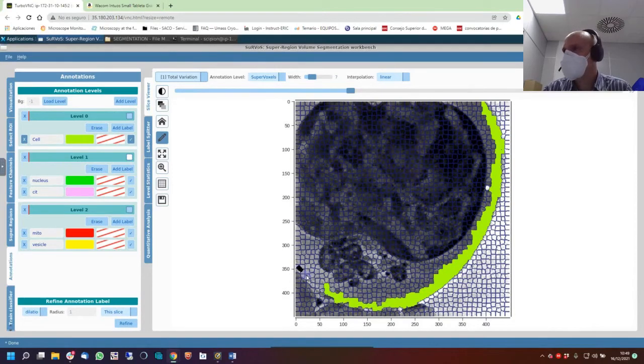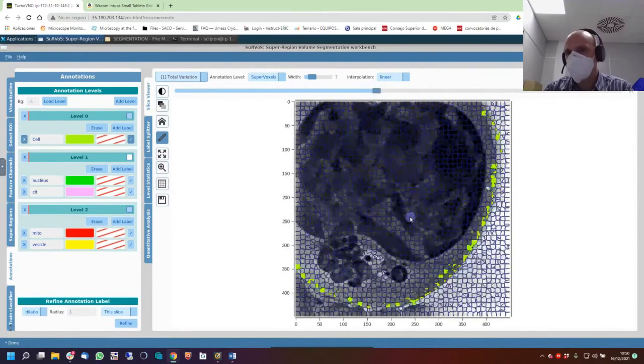You got it? You can play with this a little bit. You see what's different, no? On your own. And then with the wheel of the mouse, go up and forth. You'll see they are not restricted to one plane.